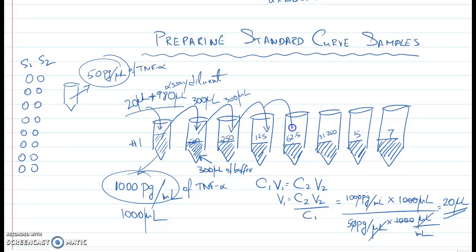And I do this till I reach the last tube. This is called serial dilution.